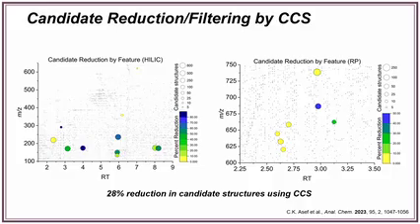And so that's an average. And you can see by looking at the plot that it really covers a pretty big range. There are some that have very small improvement, maybe 3%. There are others that are a little bit better and go more towards 40 to 50%. So it's very much determined by the analyte itself and how much overlap there is in some of these potential molecules that you're looking for.